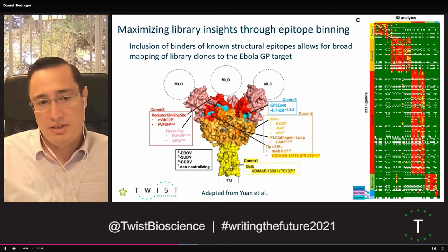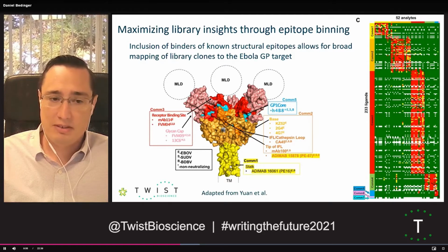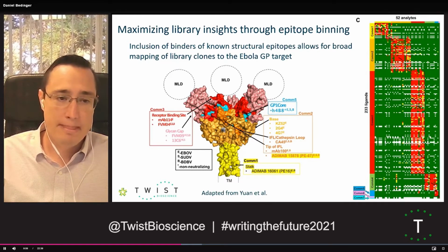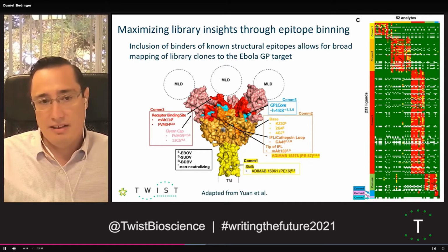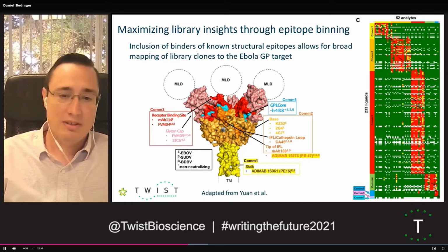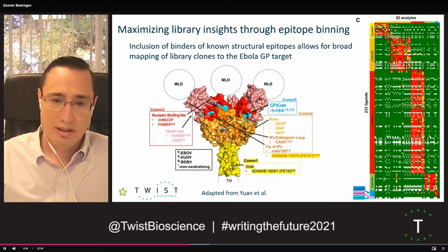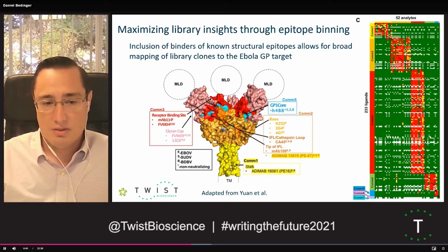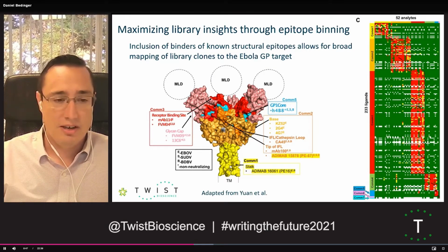And with this information, you can learn things about what mutations the antibodies are likely sensitive to based on the interaction face of the molecule. You can also understand which conformational state of the glycoprotein the antibodies are likely able to bind in, and which ones can be combined together to make a cocktail. So this was a great early example of how a huge amount of structural information can be learned about a set of clones in very little time, but with really useful levels of resolution. And again, this was really nice work by Tom Wan at Twist, working also with Yasmina Abdiche at Carterra.